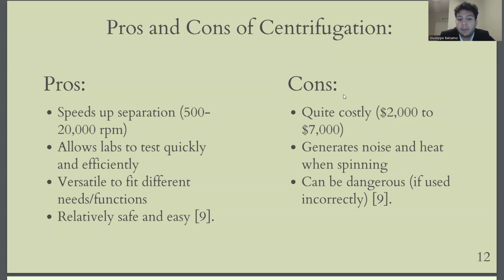Centrifuge machines are also incredibly versatile and can be modified to complete specific and unique lab functions. These include everything from separating or concentrating substances to filtering or rinsing substances. Again, as we talked about, within the two main types of centrifuge machines, there are different subtypes.